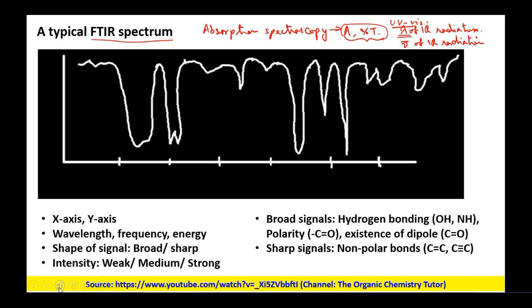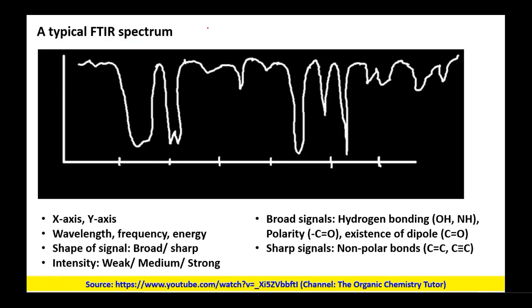While discussing wave number, we have also discussed that energy is equal to h nu, where nu is the frequency, and this can be given by hc by lambda, which again equals hc times the wave number. So as the energy content increases, the wave number will also increase. Higher the energy, higher the wave number and higher the frequency.